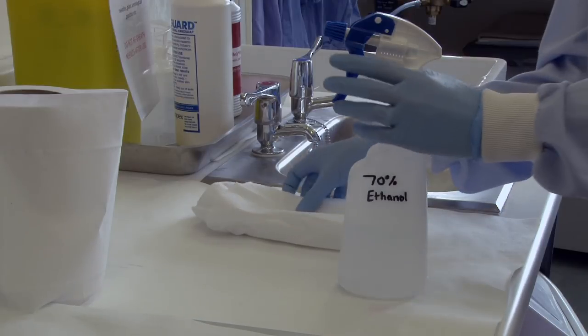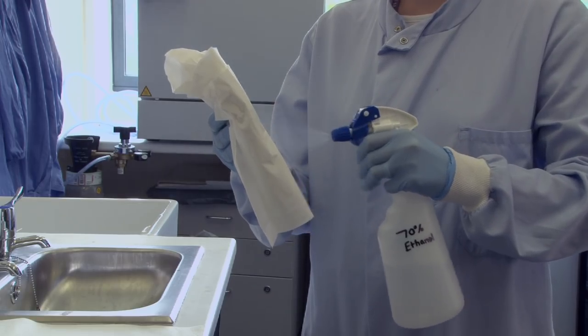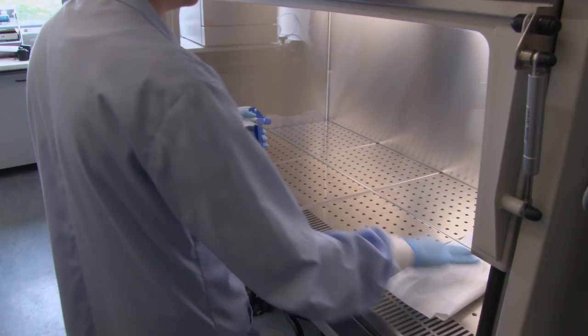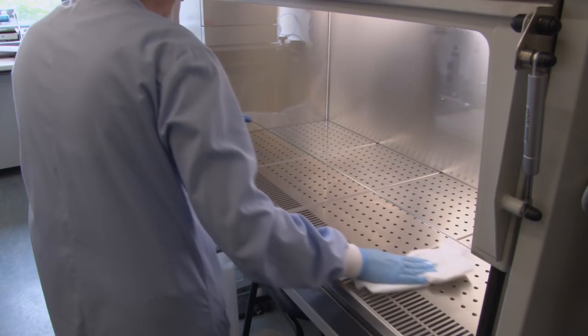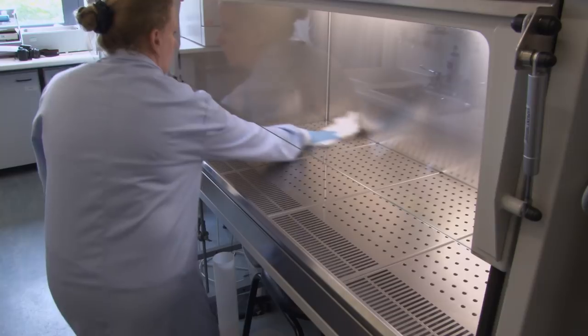To clean the cabinet we use 70% ethanol which is a very safe surface disinfectant. Spray generously onto the cleaning paper and disinfect all the inside surfaces of the cabinet. Make sure all of the surfaces are cleaned and ensure you work into the corners.